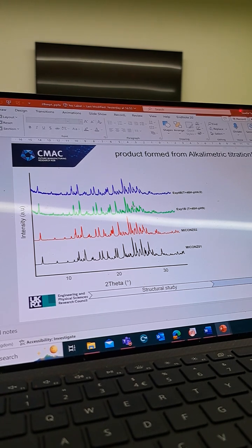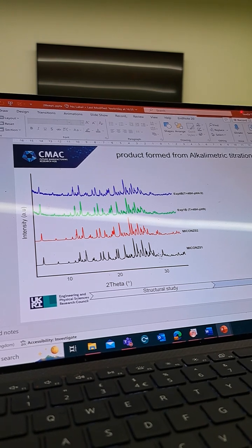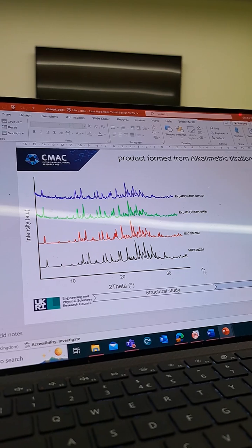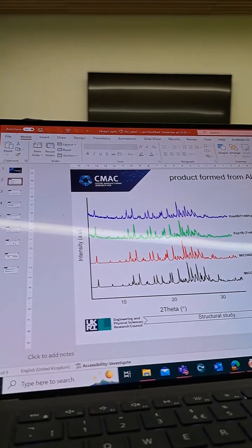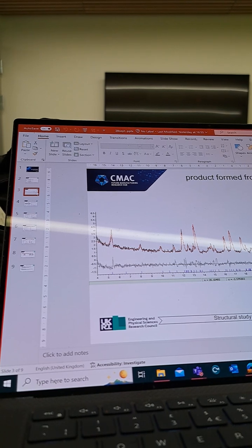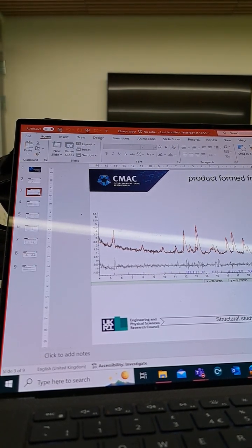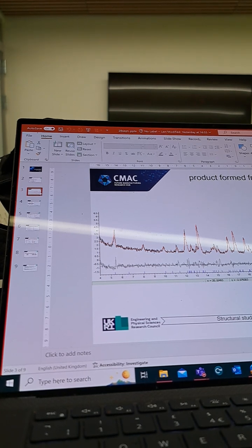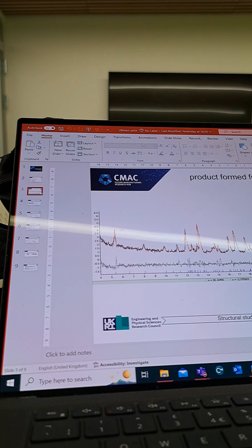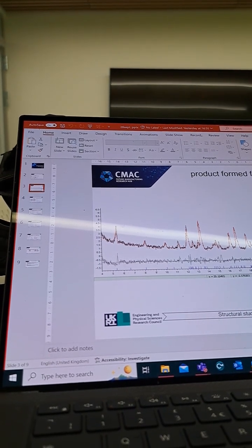Did you fit the pattern with both miconazole 1 and miconazole 2? I just did with miconazole 1. These are different structures building up. I will do it with miconazole 2 as well. This data fitting pattern is with miconazole 1. The patterns are extremely similar, so you're probably going to get as good a fit with the other structure. Okay, fine.